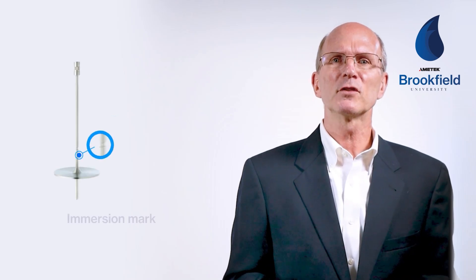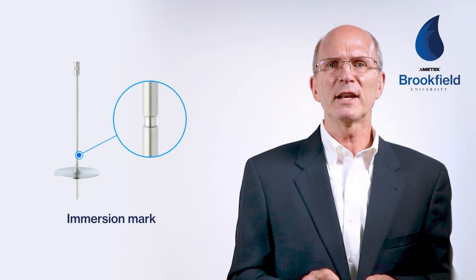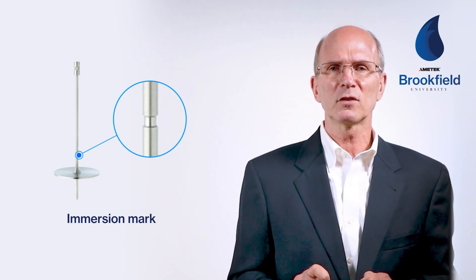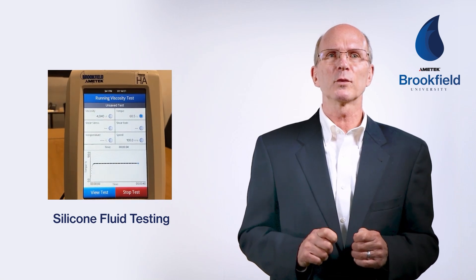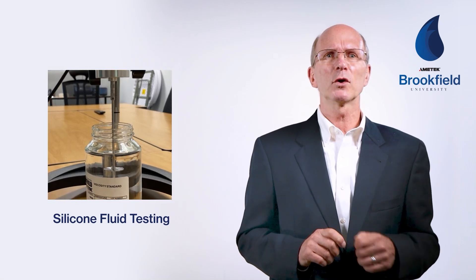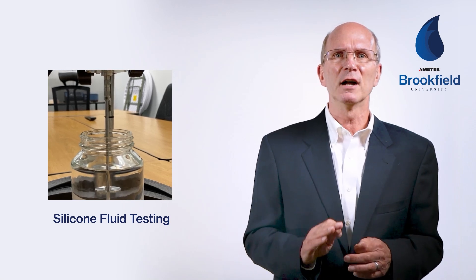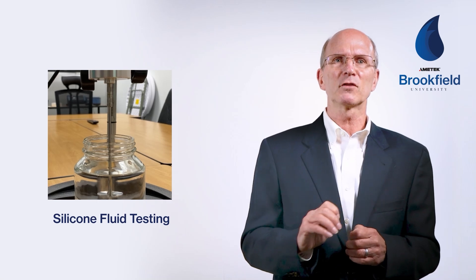Notice that on each spindle there's an immersion mark just above the disc. This immersion mark should be set at the surface of your sample. Not enough immersion will lead to lower fluid resistance, and if submerged too deeply, a higher fluid resistance. Here you can see an LV4 spindle and guard leg performing a test with a general purpose silicone fluid. Using the proper container with an internal diameter of three and one quarter inches — for example, a 600 ml low form Griffin beaker — the container must be filled high enough to allow the immersion mark of the spindle in use to be set at the surface of the sample.